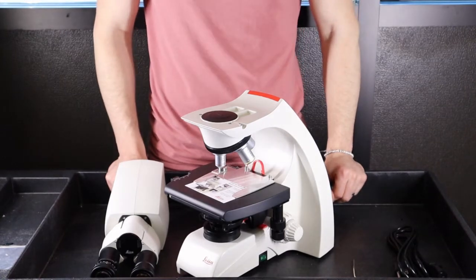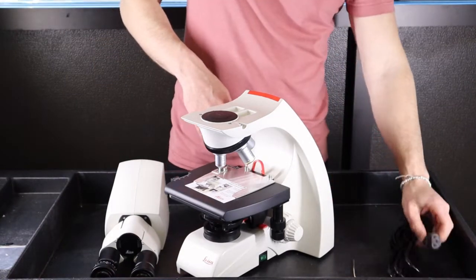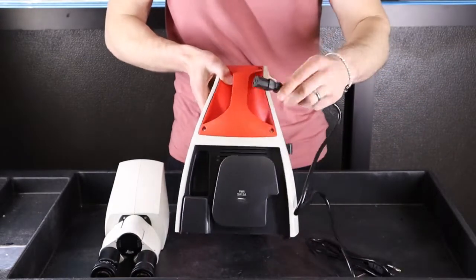This video will show you how to set up your Leica DM750 microscope. First step is to plug in the power cable to the back of the microscope.